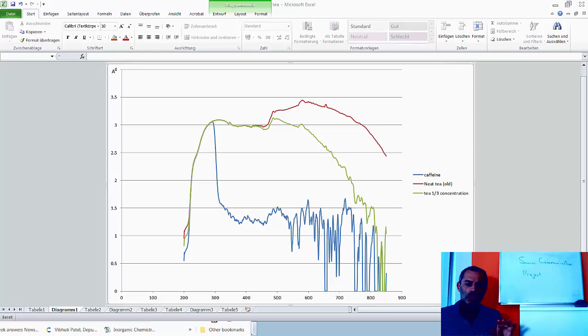So hopefully by this time you've all looked and seen the possible papers and the mechanism for measuring caffeine that I suggested which is spectroscopy. Going over to this other screen we can see that I've measured in the visible and ultraviolet region. This bottom axis unlabeled, sorry about that, is the wavelength in nanometers and you can see that caffeine, the blue curve, has a very wobbly bit of spectrum down here. That's because the spectrometer isn't very good and it's not very accurate when it's either not measuring very much absorbance or when it's measuring very high absorbance.